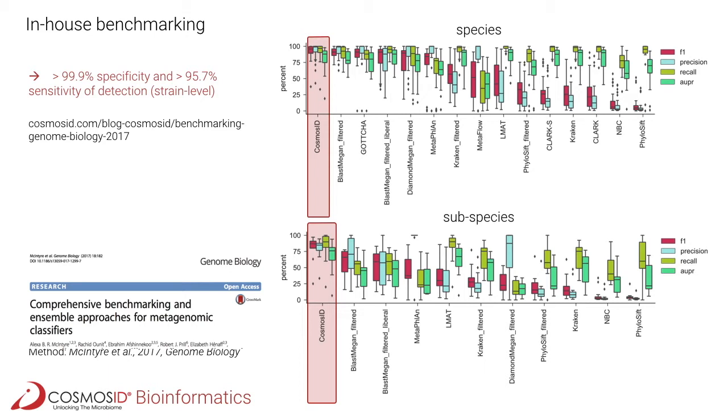You see here in light blue the values for precision, in light green the values for sensitivity, here labeled recall in the legend. And what becomes apparent as you're looking at the upper chart on the left-hand side is that many of the public algorithms are seeking to optimize either precision or recall, and they do that at the expense of the respective other value, which is either lower in its average or more variable.